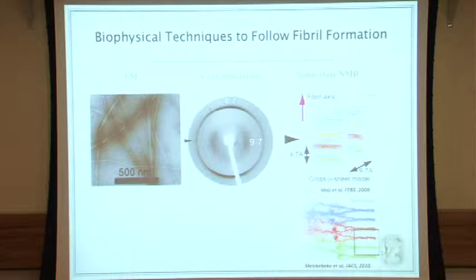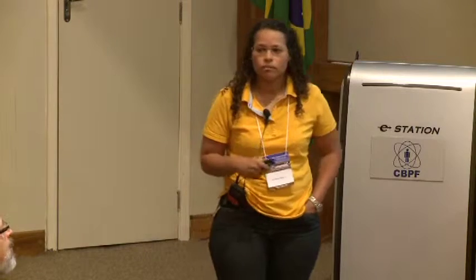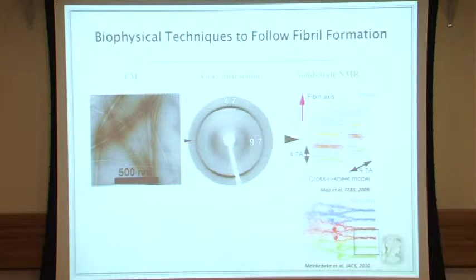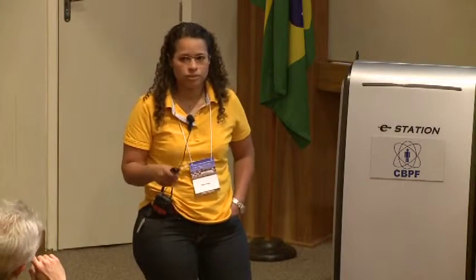So here we have solid-state NMR. With some constraints that you can obtain from this technique, you can get a model, or you can get a structure. It will be dependent on the quality of your data, how many constraints you have per residue.